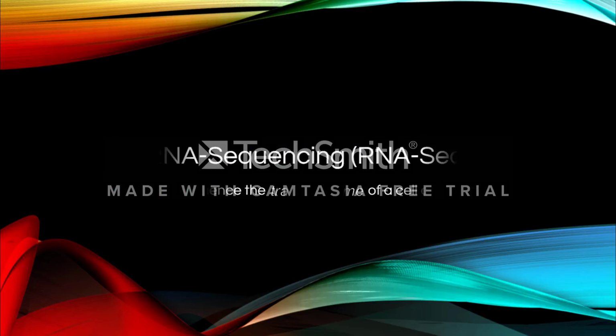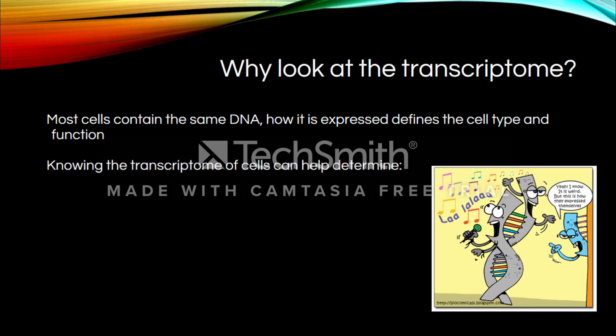RNA-Seq is a technique used to sequence the transcriptome of a given cell or tissue type. The transcriptome is the complete set of transcripts and their quantity that are made in the cell. This gives information about that particular coded RNA, which includes the quantity, and tells expression of a given developmental or physiological condition. RNA-Seq is made possible by next-generation sequencing.